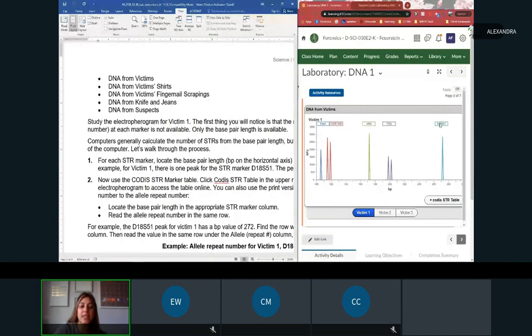So we just look at specific parts of the DNA, because remember that the DNA is this huge thing. So we really just focus on 4 markers, which just means these 4 specific placements in the genome, and they can use that location, that gene, and that DNA sequence to determine what the alleles are, what those genes are. I can't tell you exactly what these are all for, but this is a specific gene sequence that they are looking at in this individual's blood that came up. Does that make more sense, Courtney?